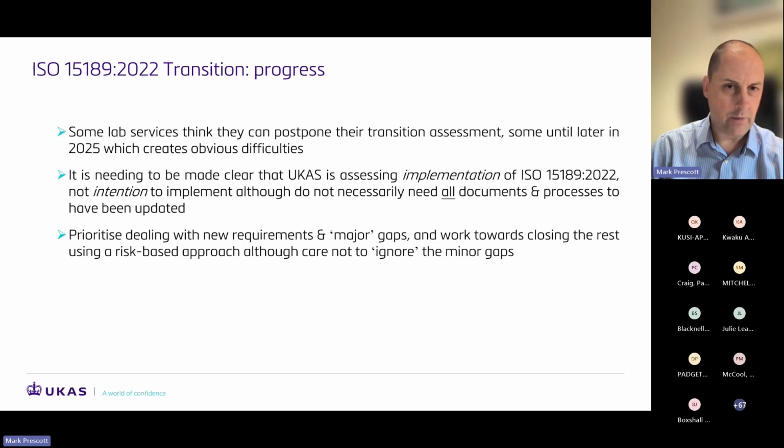So even though there is a risk-based approach, be careful not to ignore the minor changes, because they will get looked at to some extent. They're not getting a lot of transition assessment, but they will be getting some attention.